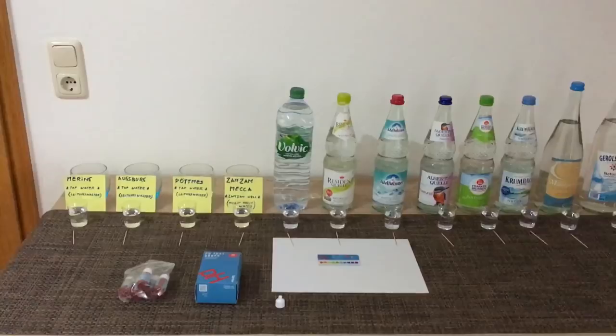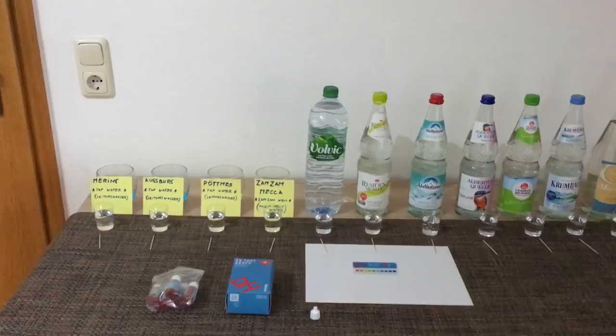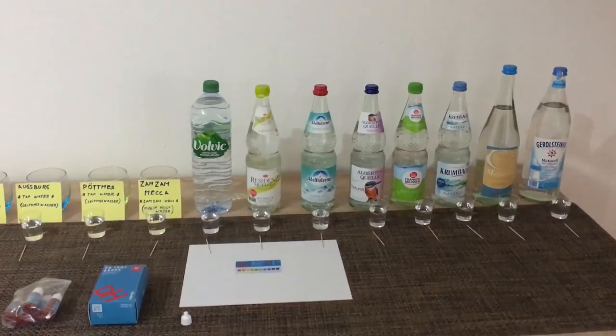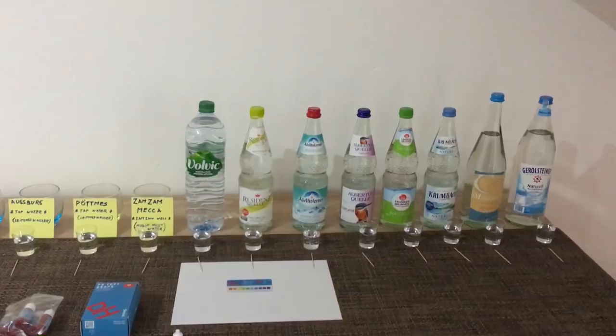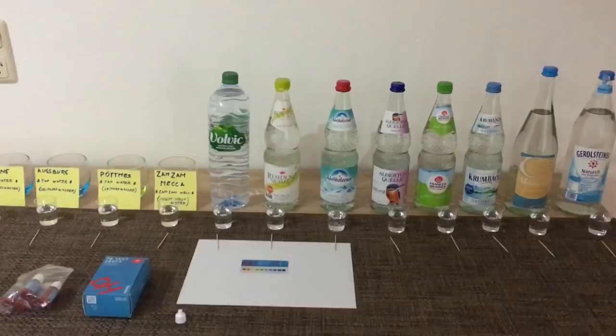Hello everyone and welcome to my YouTube video test — this is the first ever test and hopefully not my last. I'm trying to test a pH level in water here in Germany, or to be exact, southern Bavaria. This is just a small selection of the water actually available to buy in a local store. There are approximately hundreds of different water products you can buy, so it'd be impossible to buy all of them — not to mention I'd probably be broke by then.